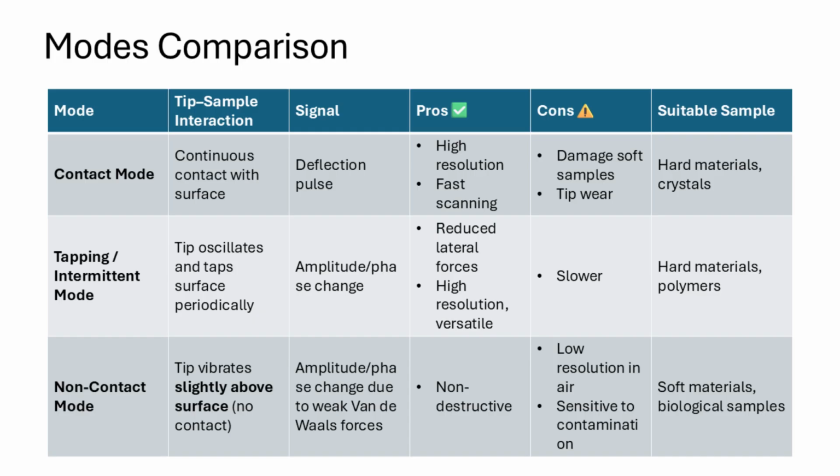Its pros are high resolution and fast scanning. Its cons are that it will damage soft samples and the tips will wear. Its suitable sample is hard materials like crystals.